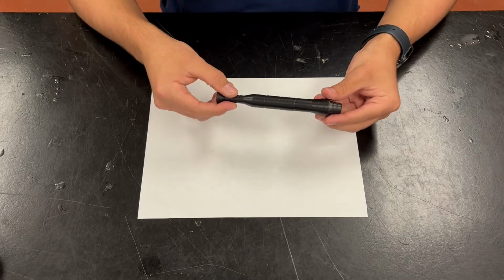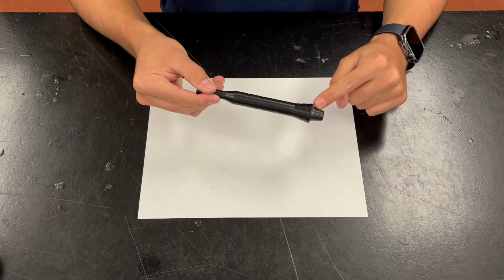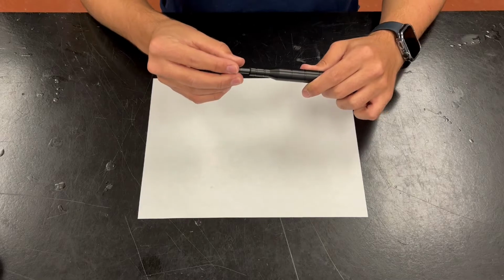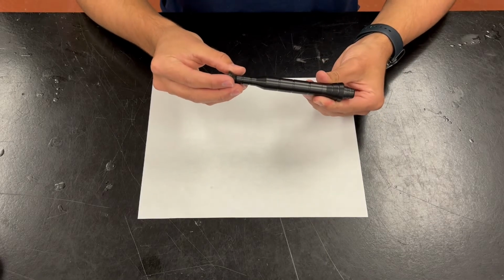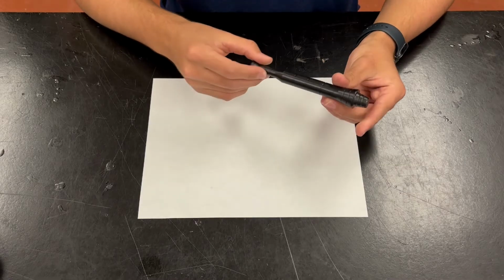Before we start, I'll show you how to use a magnetic brush. This bulky part at the end is where the magnet is located. This skinny end is where we pull the magnet up and away from the surface, which will prevent it from attracting the powder. It's like an on and off button.